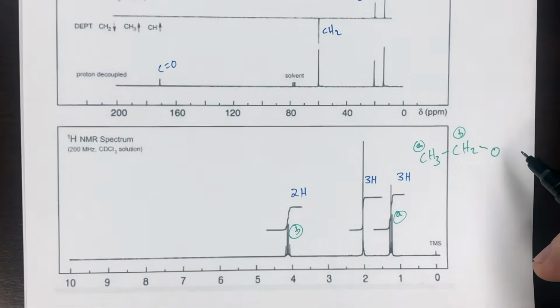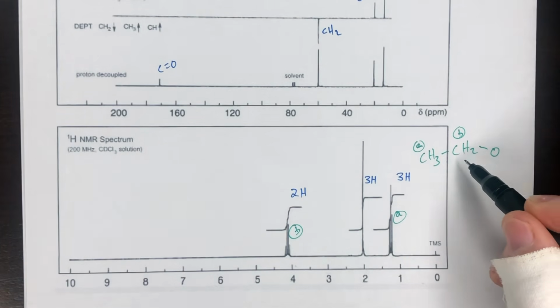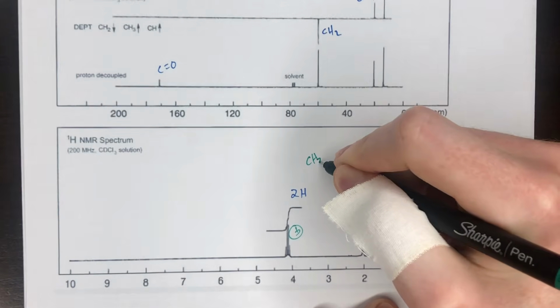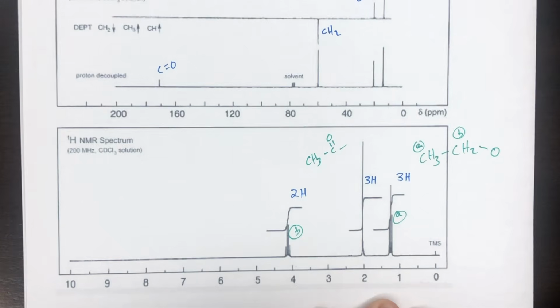But in terms of this case, all we're really talking about is electronegativity, and these oxygens are going to deshield the hydrogens on that carbon much more so than a carbonyl would. Right, so this explains why B would be at around 4, if it's bound directly to the oxygen. And then the only other signal that's left is this 3 hydrogen singlet that's around 2, and this is indicative of a methyl bound to a carbonyl. That's why it's a singlet, because there's no neighbor that has a hydrogen. So that makes perfect sense.